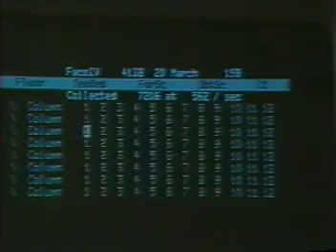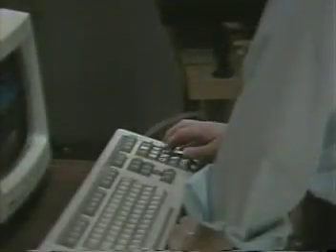Looks pretty good, actually. Okay, I'm going to collect that. To collect, Tom hits execute again. This time, the label information is transferred onto the top portion of a new analysis card, which appears as a gray line at the top of the screen. As you see, the gray line lists the cell type in the sample, the name of each FACS channel from which data is being collected, and the sample number.